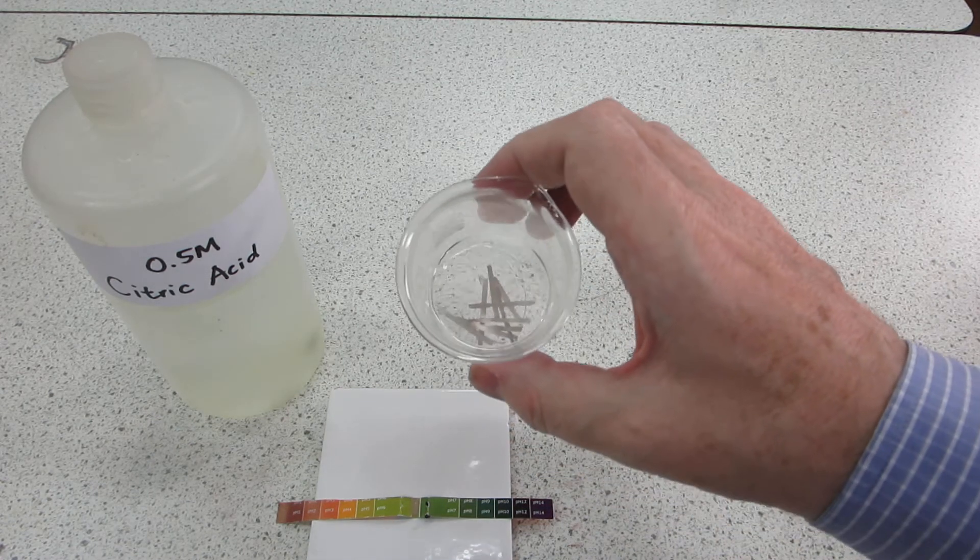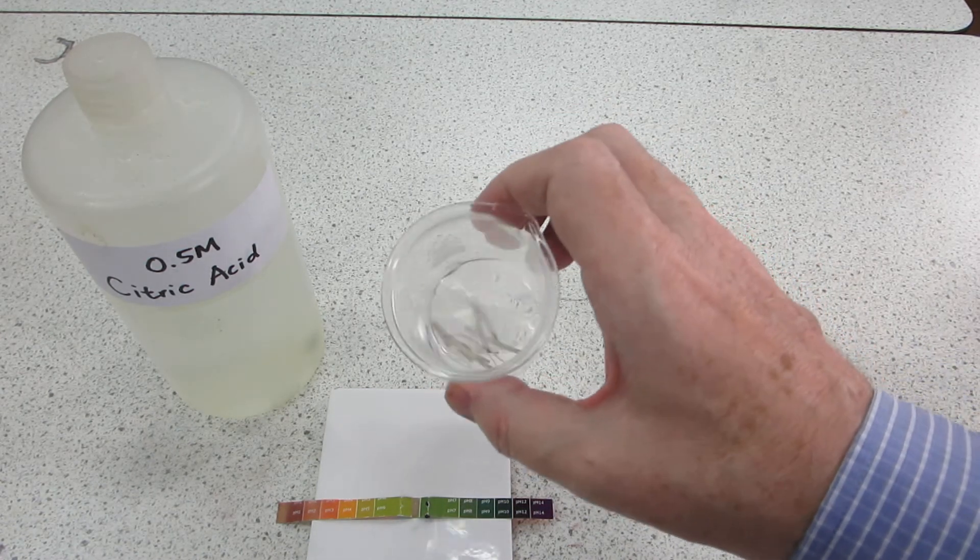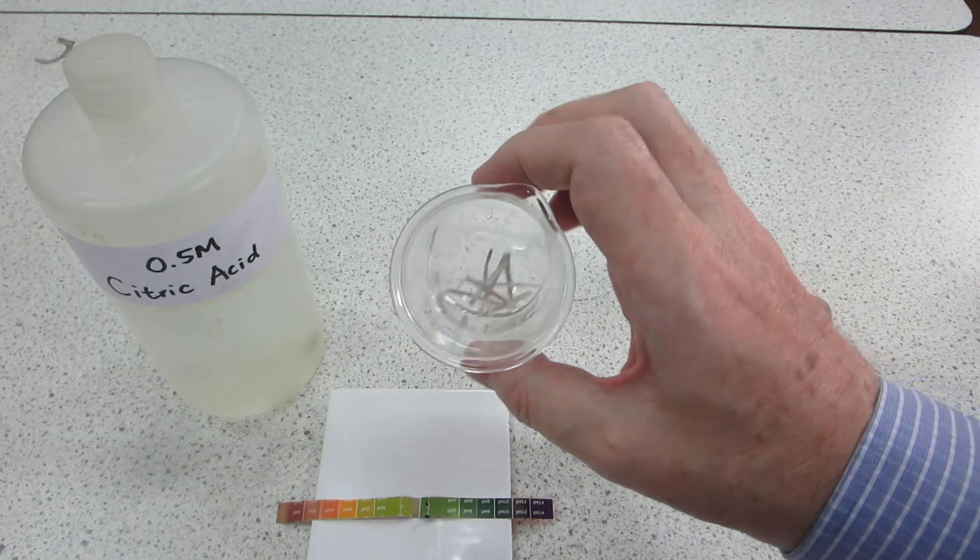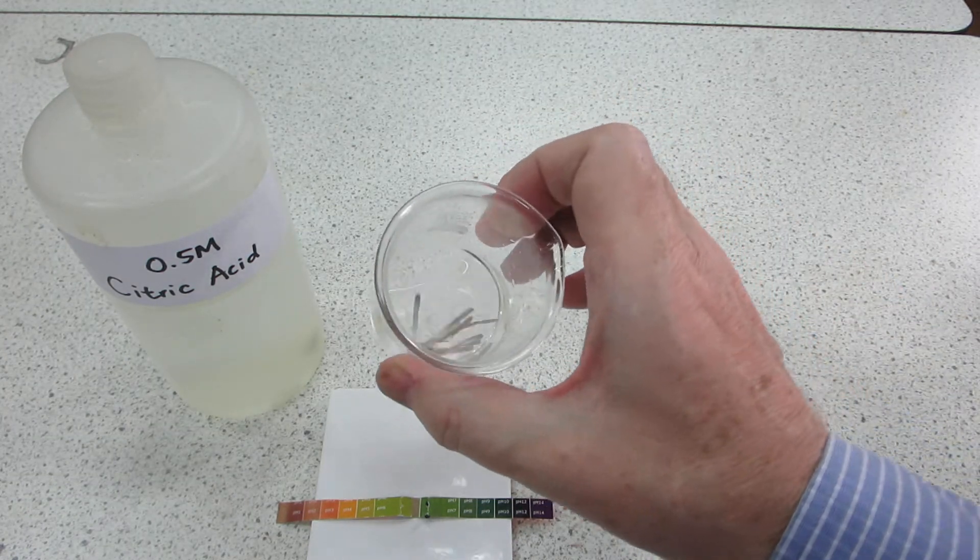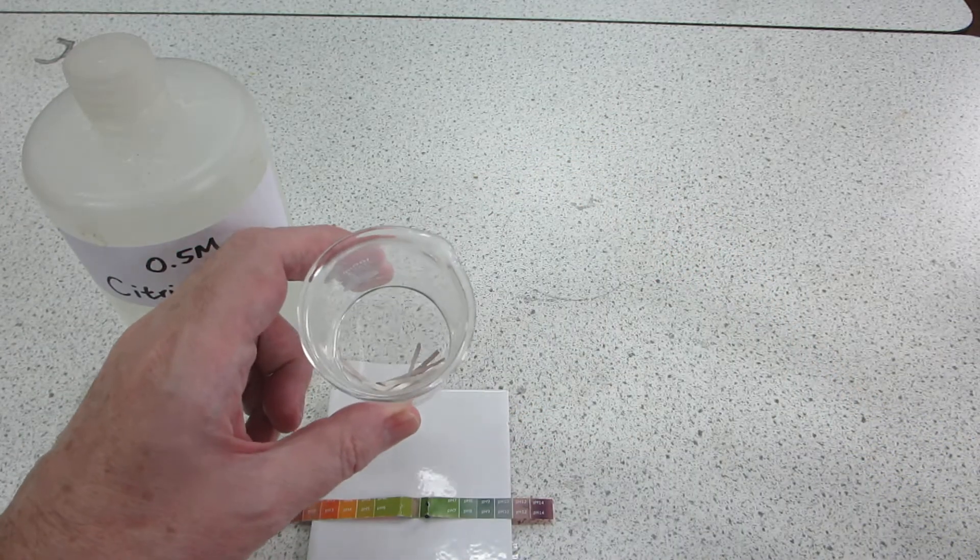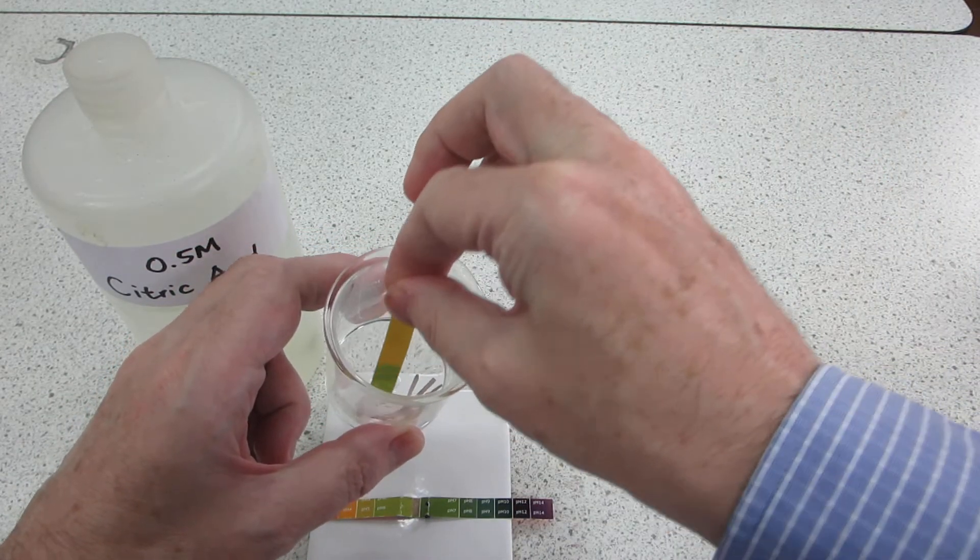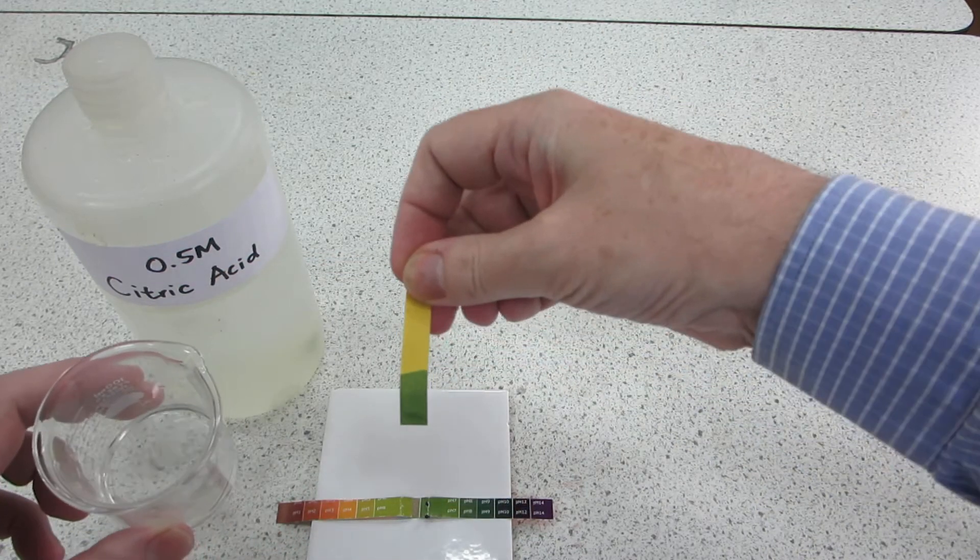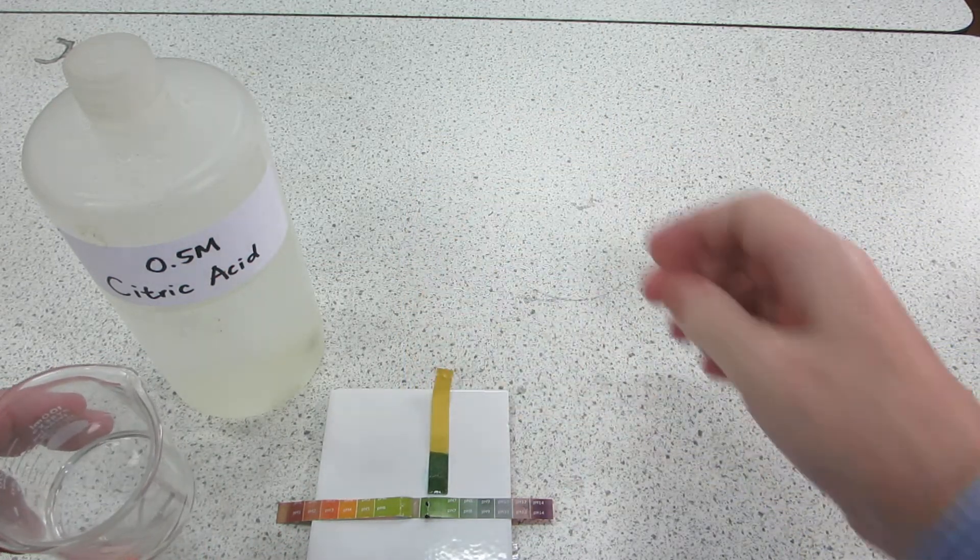After a few hours we can see that the magnesium has reacted with all of the citric acid because there are no longer any bubbles being produced around the metal. We can show that the reaction is over by testing the pH of the mixture and you can see that it's now around pH 7.